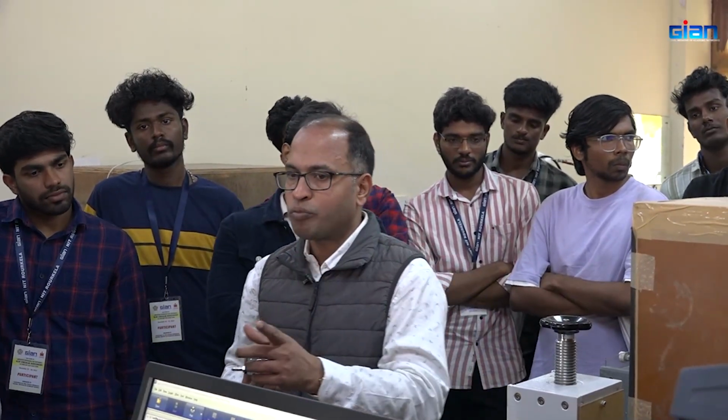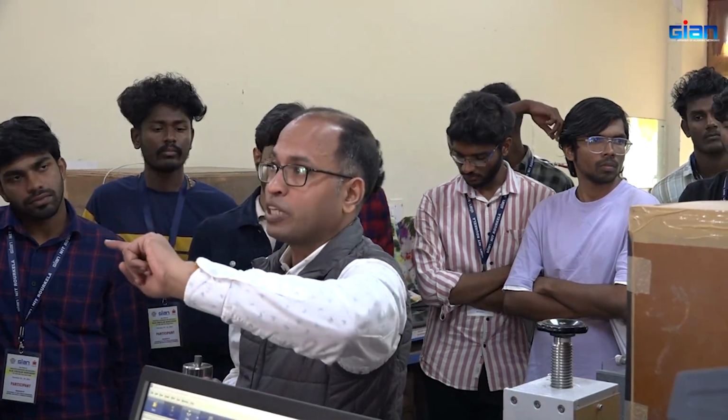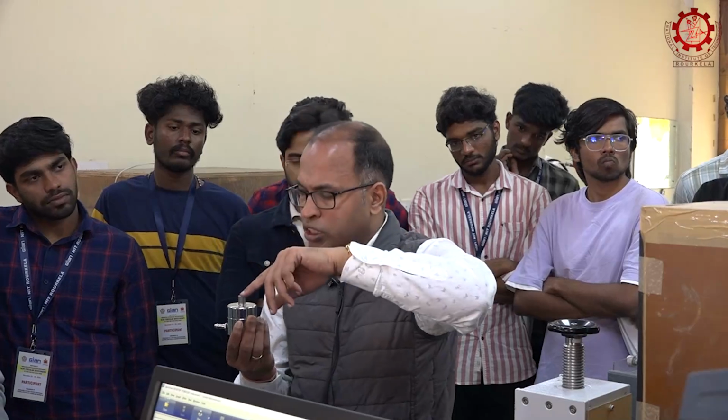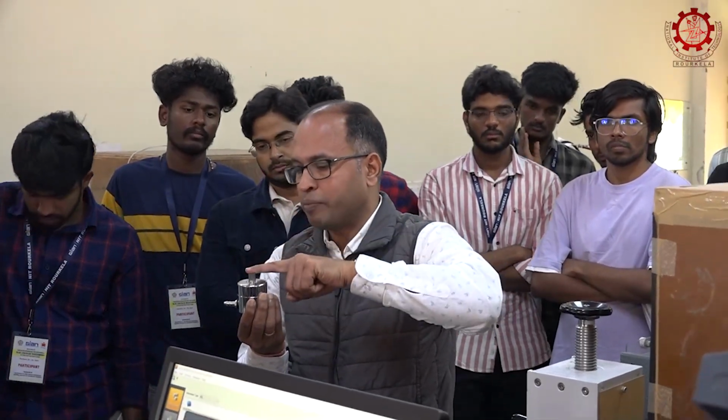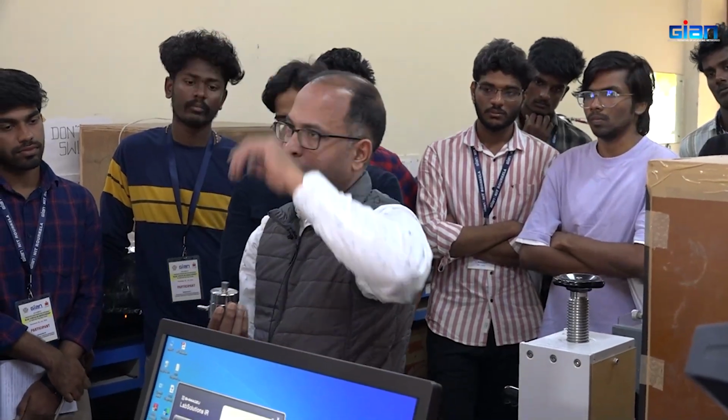Okay, mixed with potassium bromide, because potassium bromide doesn't absorb in this region we are studying. That's why potassium bromide is used. And once you make the solid mixture, then you make it a thin film here and study there. Again you get the spectrum like that, and that can be studied.